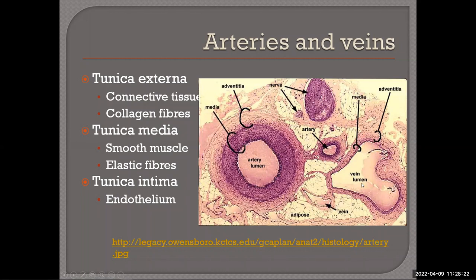it could be argued it's actually smaller because this is the tunica intima lining in here. So the lumen would be just this part here, the clear part, not all of this to the back here. Okay, this is a poor example to use.